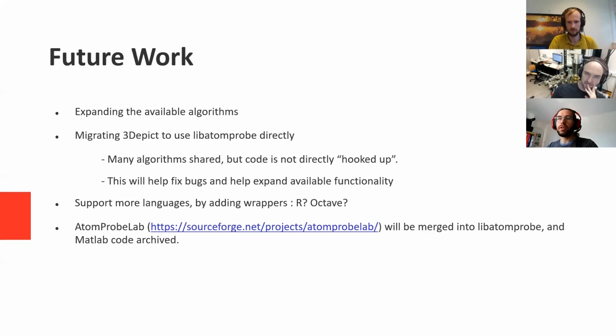I've used it, for example, where I've written my own interface, but the back-end computation is all done using Libatomprobe. 3Depict is Dan Haley's Atomprobe visualization software. That's using a lot of common code, even if it's not using Libatomprobe directly. So in the future, I think Dan's plan is to try and integrate those closer, so it is directly dependent on Libatomprobe.